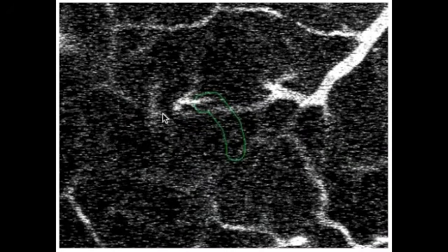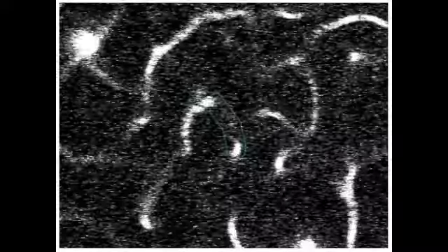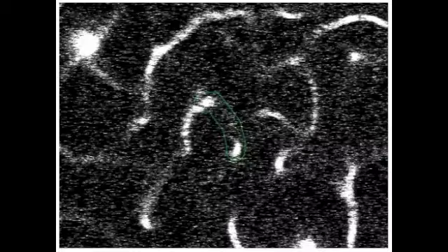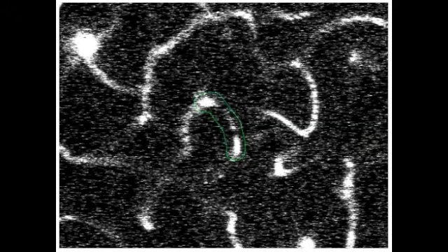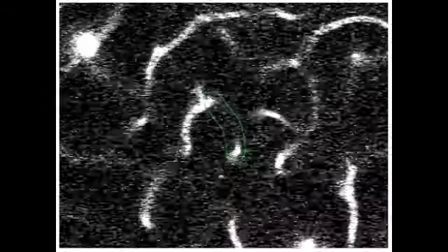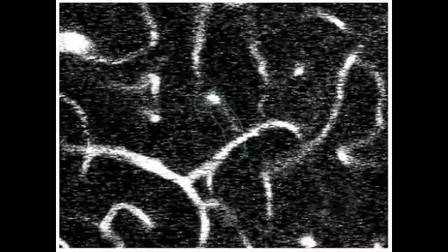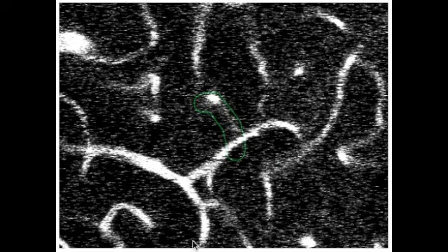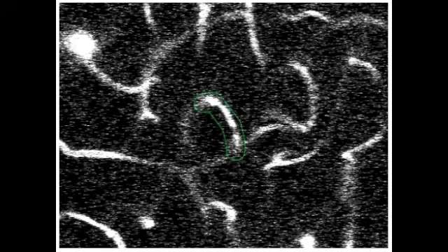This is a fairly grainy image, and we have a green outline near the center of the virtual microscope view. It's pretty clear which vessel we're annotating — there's really only one vessel that follows the shape of the outline and is visible inside it. Every vessel being annotated begins and ends at an intersection with another vessel, so that can be useful to know. Here we see one vessel joining with the target vessel, and as we move the slider the other direction, we can see the vessel at the other end being joined. Our target vessel is the one right in the middle.